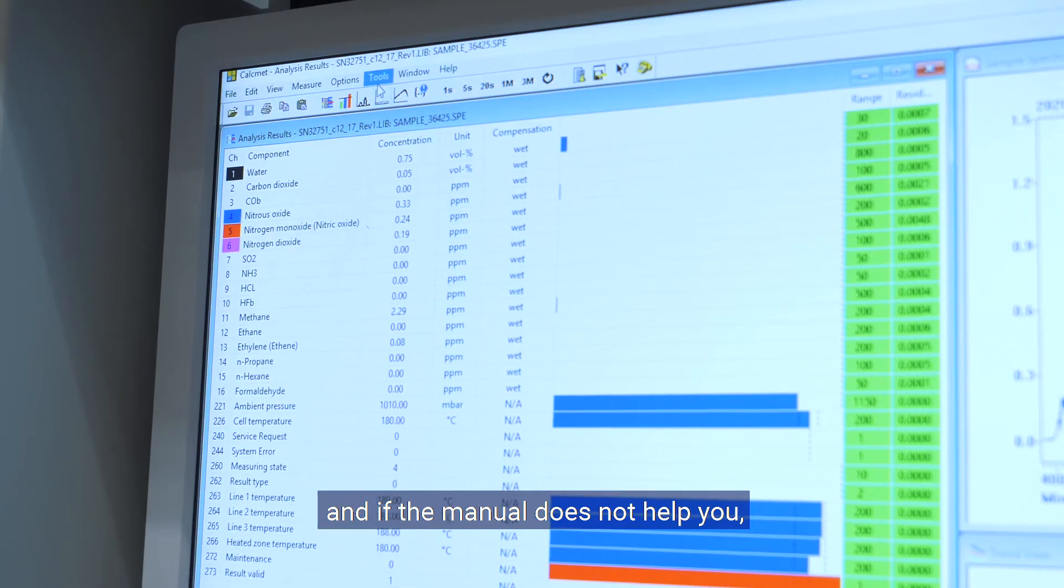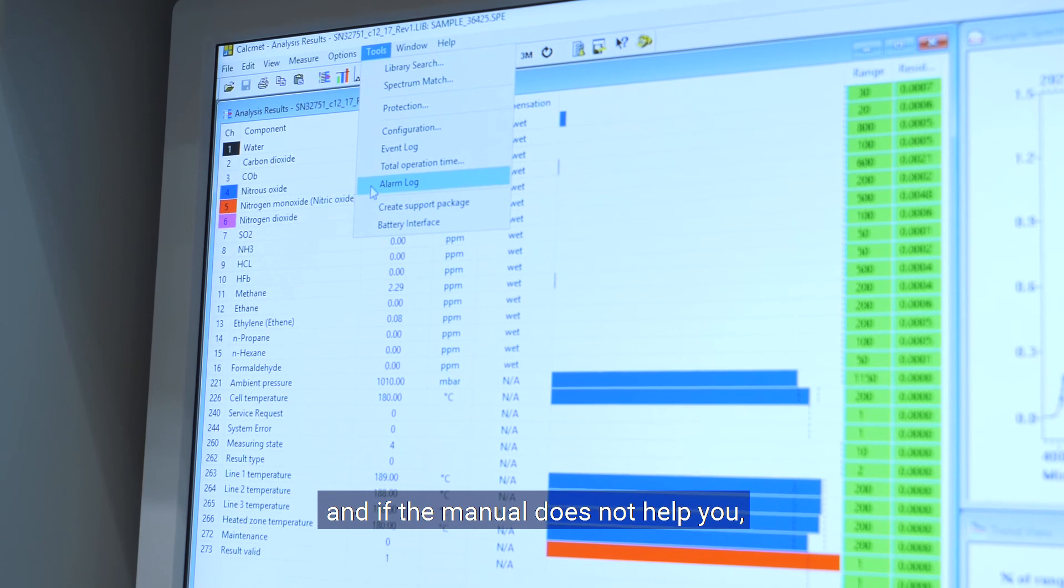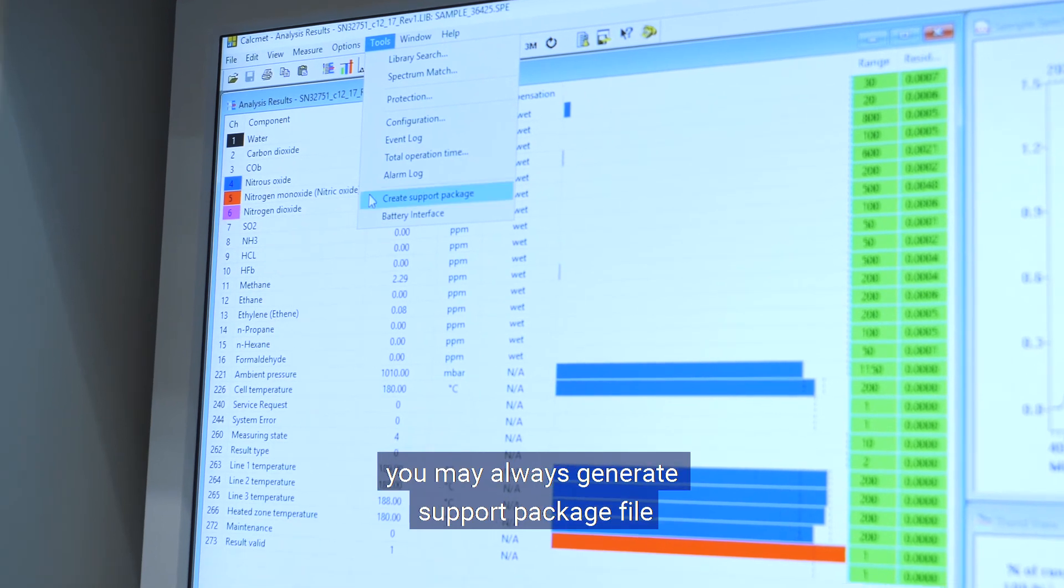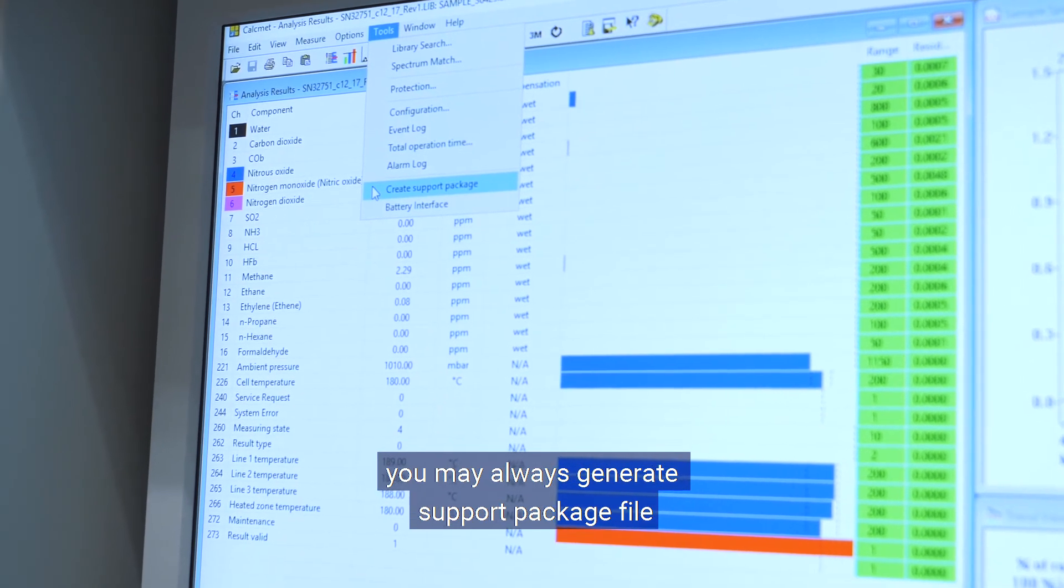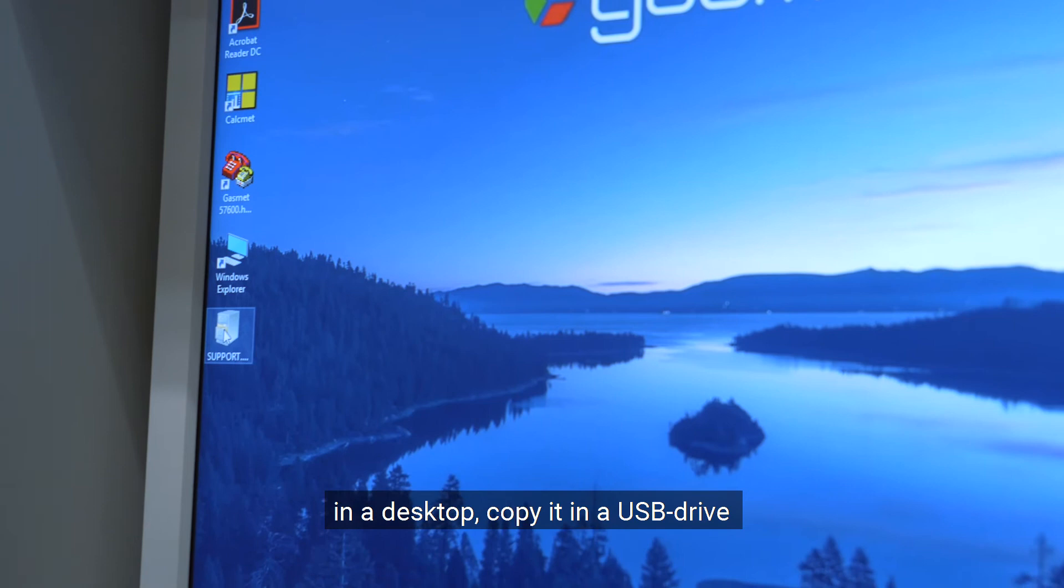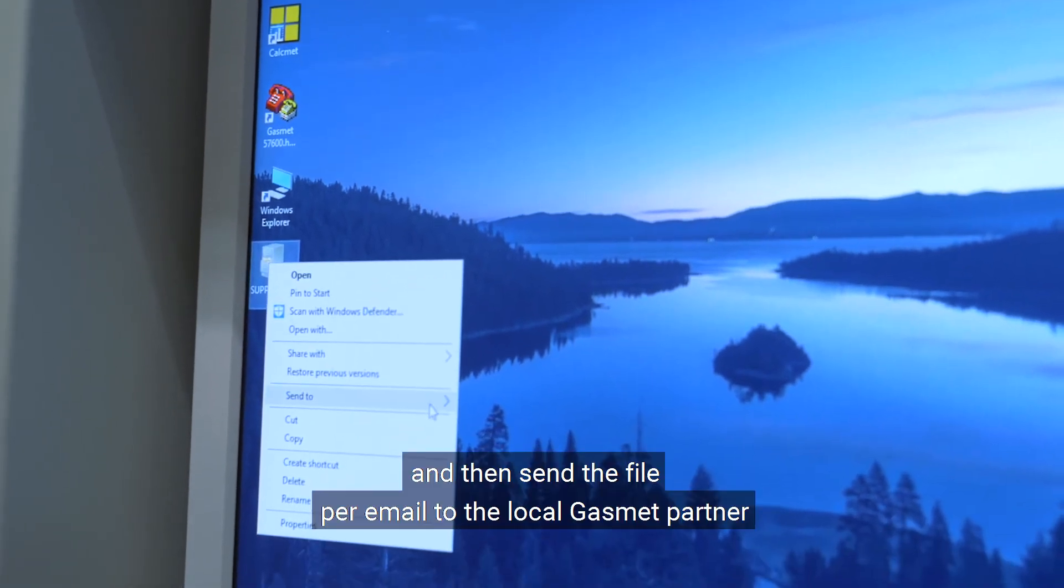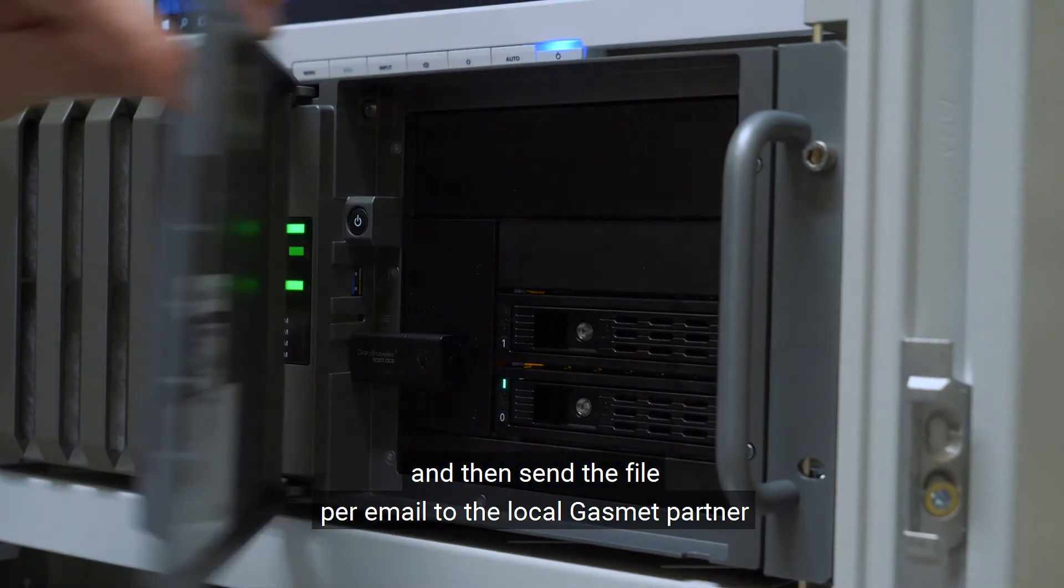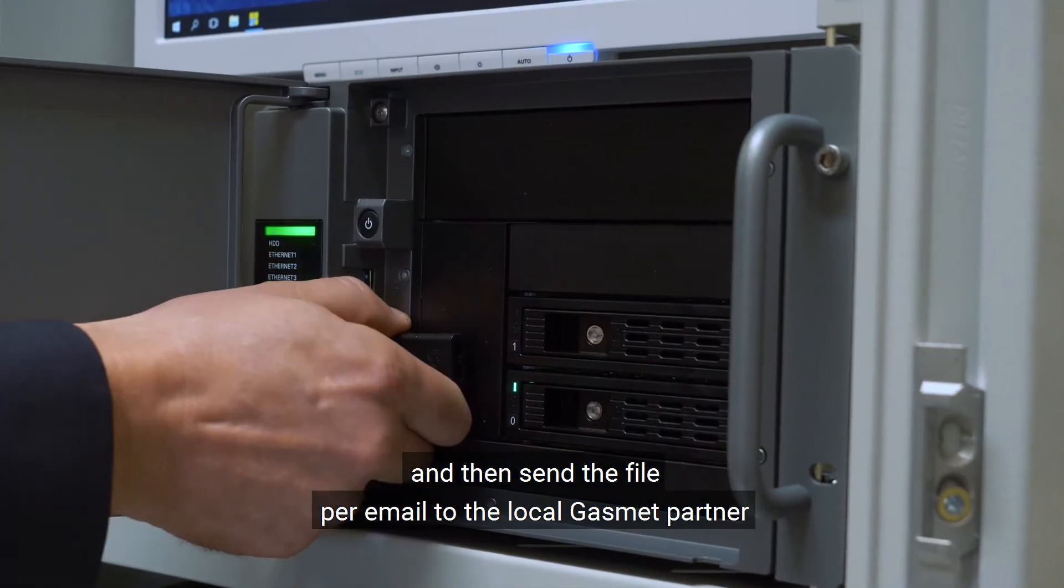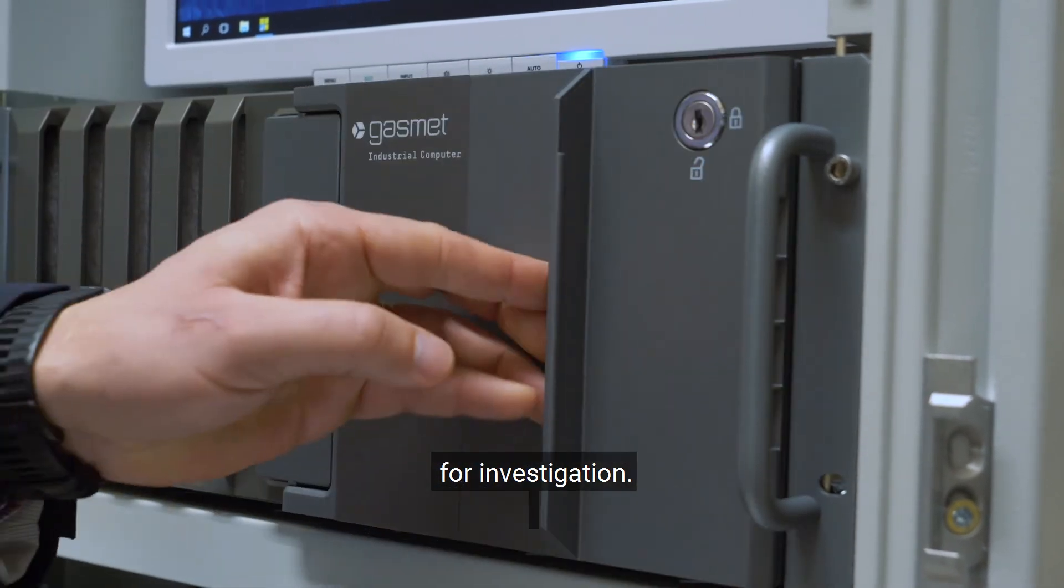And if the manual does not help you, you may always generate a support package file on the desktop. Copy it to a USB drive and then send the file per email to the local GASMET partner for investigation.